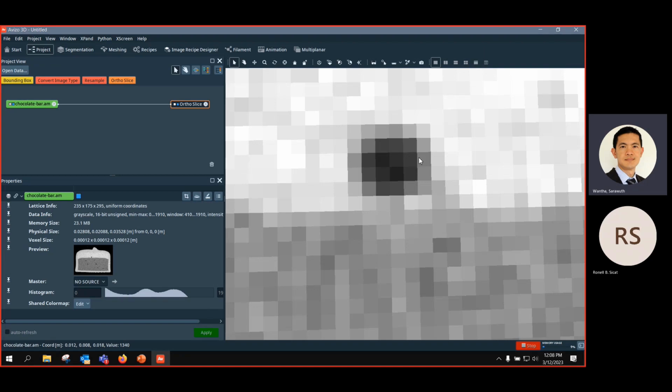And later, when we create the binary image, you can also probe which material ID it is. But at least just to understand quickly how this probing works, you just want to examine individual layer intensity or pixel, and what its number is. If I change to continuous update, you will see the value here when I hover over different shades of the intensity of each pixel. You can see in the lower grayscale or higher, the brighter is higher. So it's according to the histogram of this grayscale image.